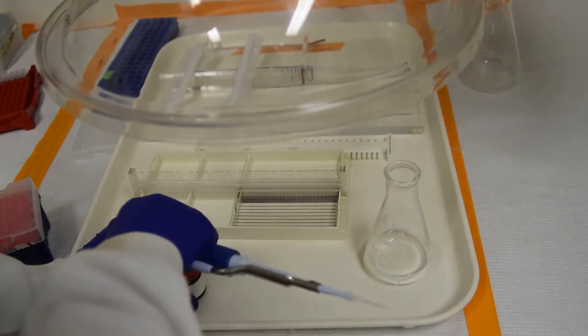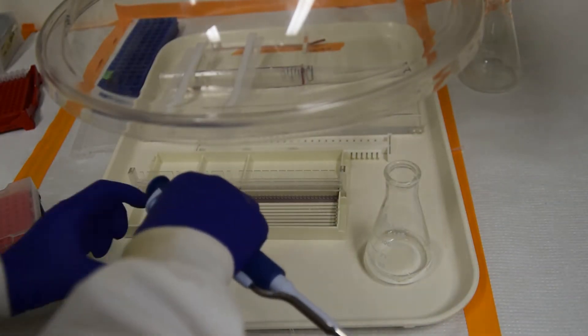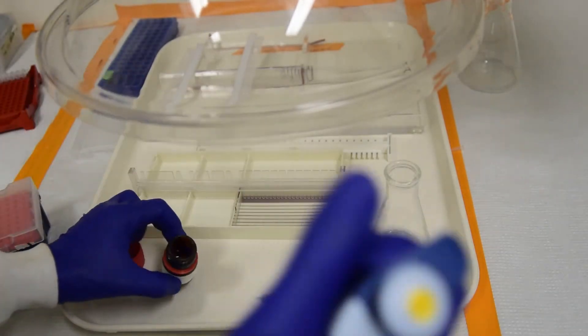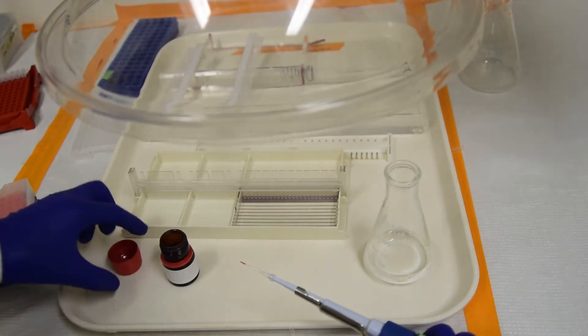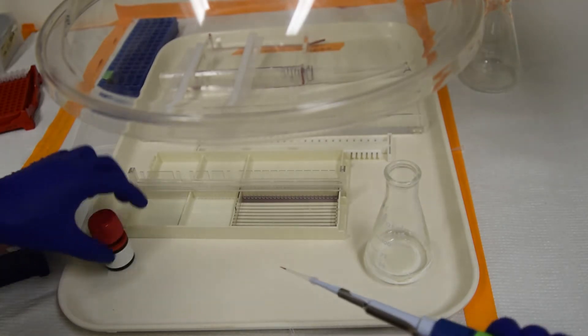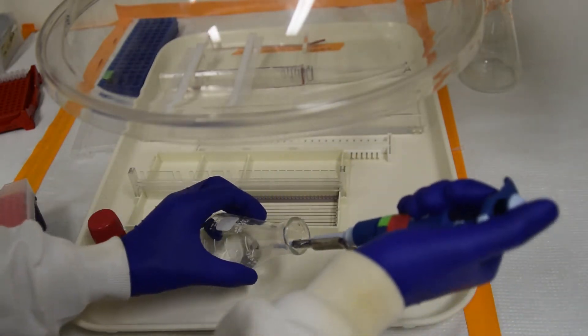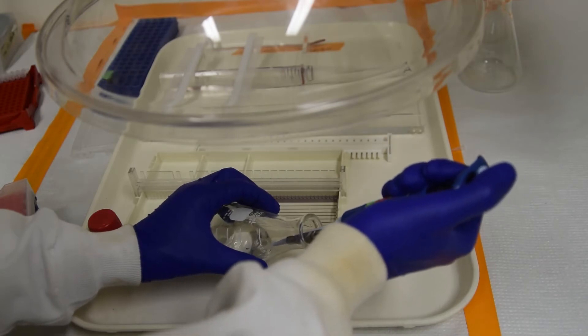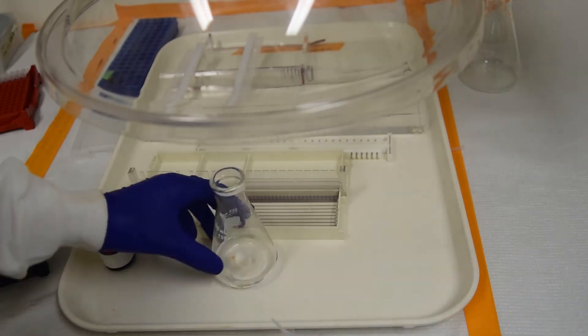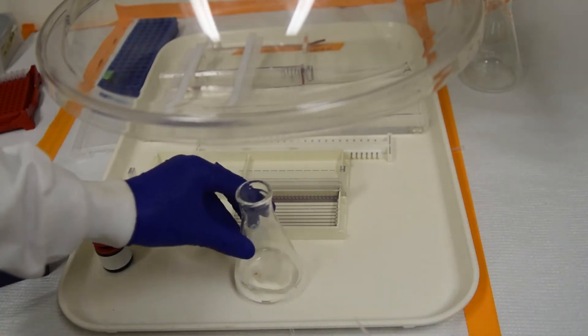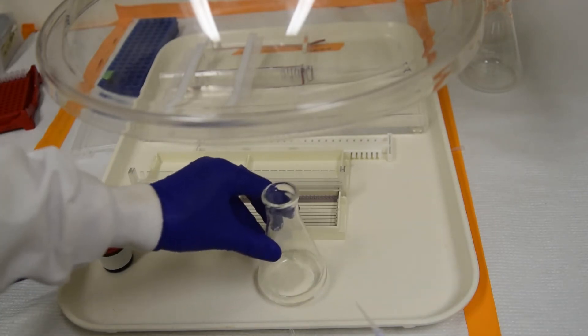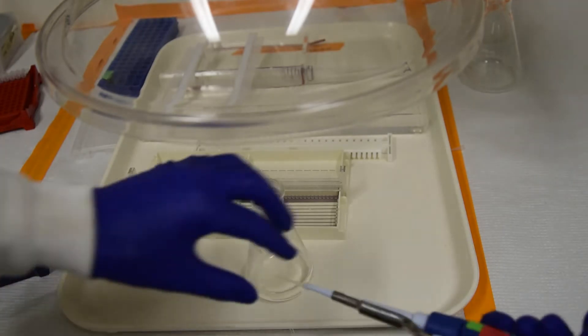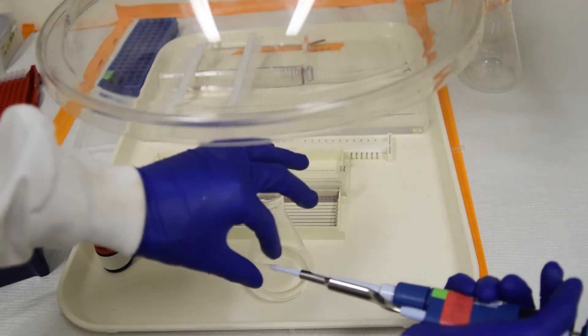Carefully unscrew it. Add the ethidium bromide and swirl to incorporate. Place your tip in the waste container.